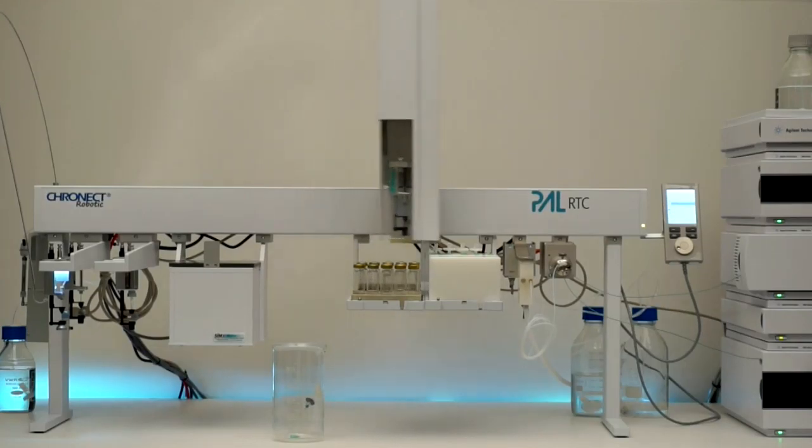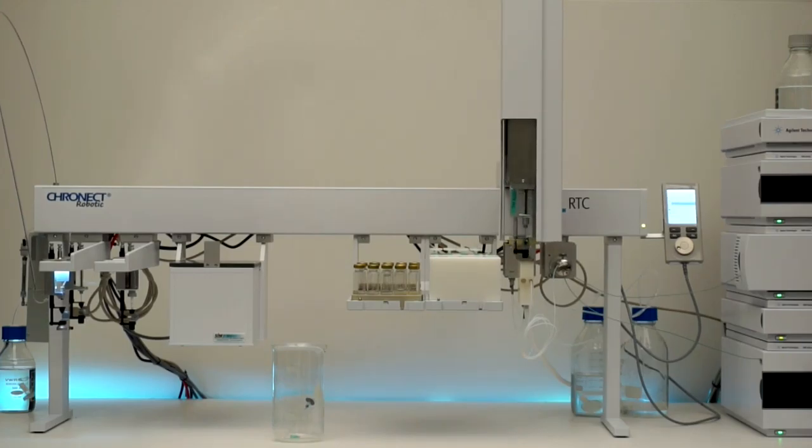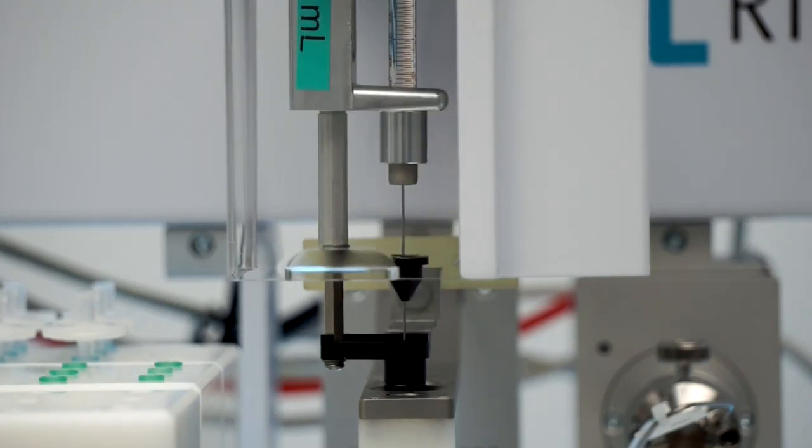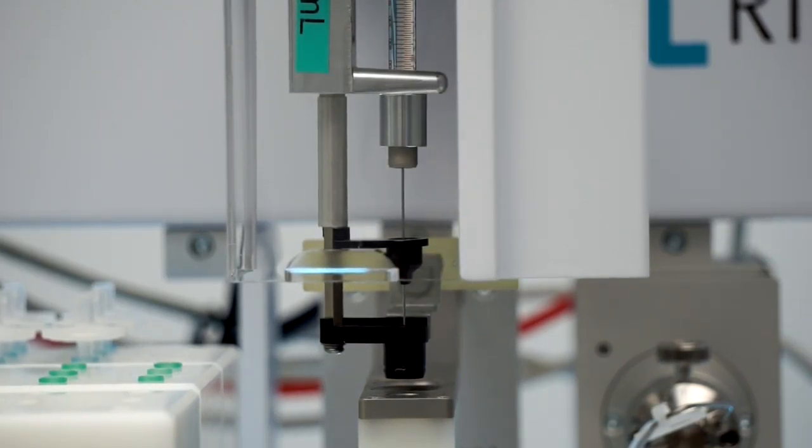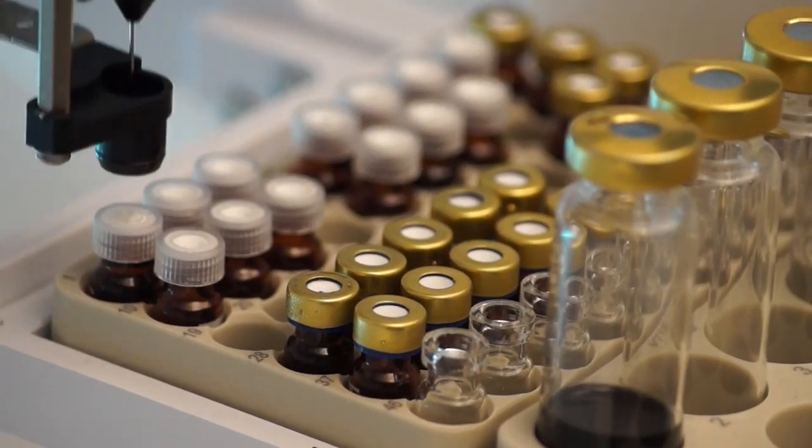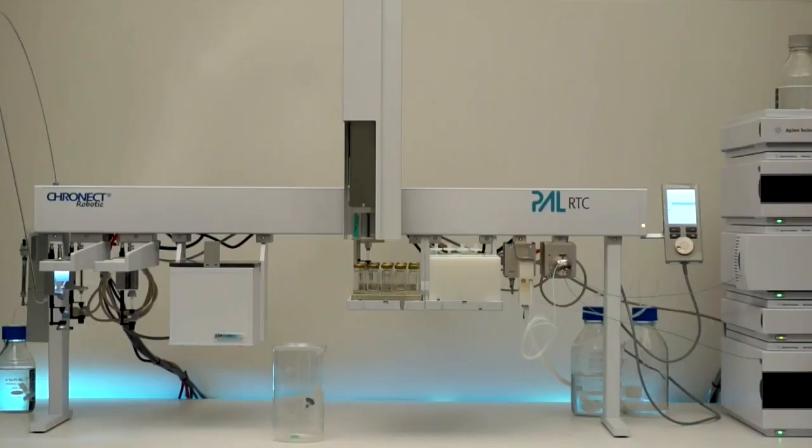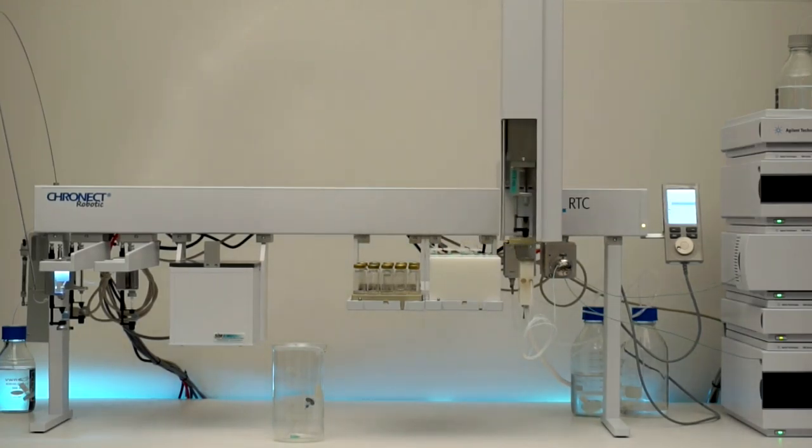The syringe is filled with solvent for dilution. This is then injected into the sample vial. The procedure is finished by flushing the syringe with solvents.